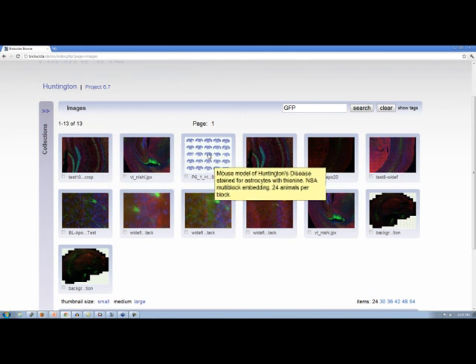And this gives you the ability to really look through and add them easily. Yeah, and this is phenomenal because, as we mentioned earlier, if you had to go back and re-audit, let's say, all the images that were captured by a previous coworker in the lab, you could easily pull out every image that was ever tagged with GFP just by doing one quick search, right? Exactly. It's important to remember that you may have images that you captured 3 years ago, and sometimes trying to find out where exactly they're stored or what they were is really difficult. This gives instant access to anything based on tags, and you can make these tags anything they want.